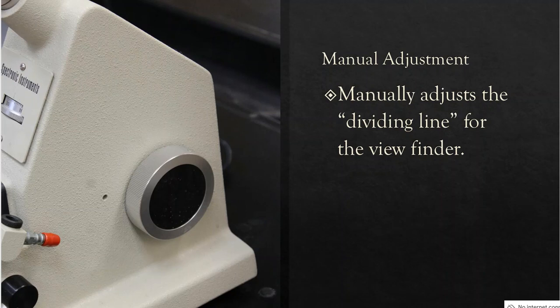So on the side of the instrument, big fat knob over here to the right-hand side. This is a manual adjuster, and it's going to adjust what we call the dividing line of the viewfinder. So this is what's going to happen, folks.